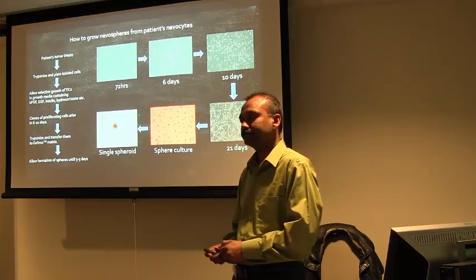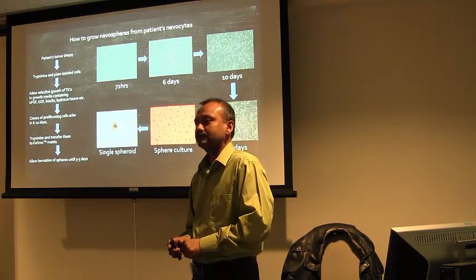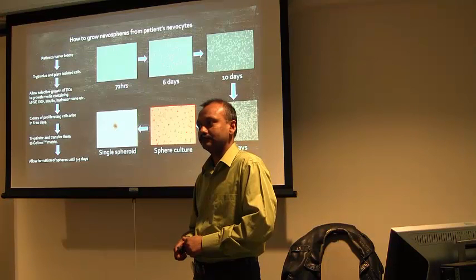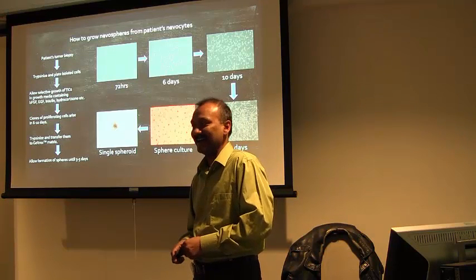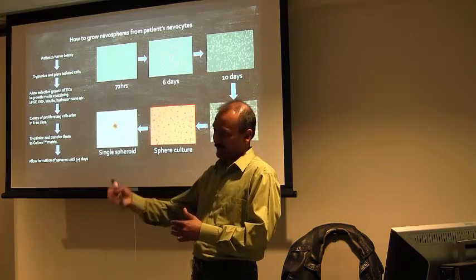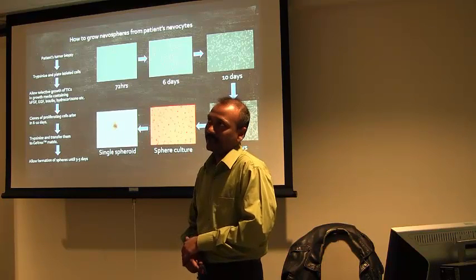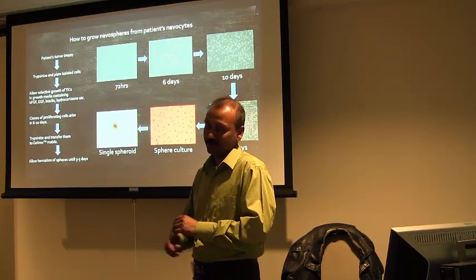And I was wondering, because it's in the spheroid, you could probably keep it longer as opposed to a monolayer plate, where you have to finish the drug assay within 3 days. Yeah, if you keep changing the media, you can really keep them longer. How long? I have kept them like 2 weeks, or more than 2 weeks.